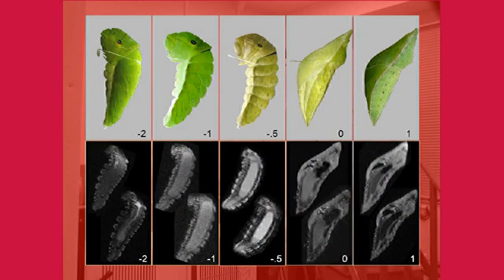Anatomical studies to date have revealed that the adult structure of holometabolous insects, including butterflies, is almost complete in the prepupa stage. However, the activity of the butterfly larvae had not yet subsided during this period, and it was thought that the changes could not be tracked well with proton magnetic resonance imaging. Therefore, this time, we decided to take the first image as early as possible after the larvae completed threading, and then take images every day as much as possible to track the changes in the internal structure after that.